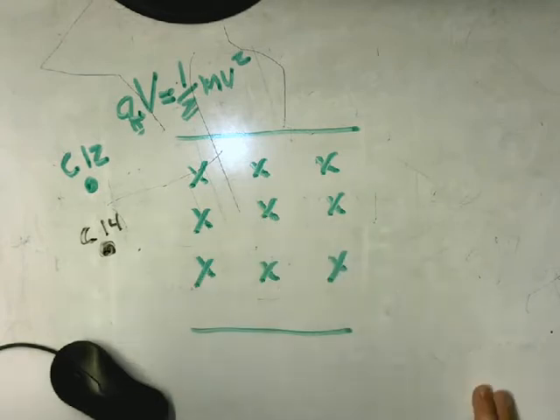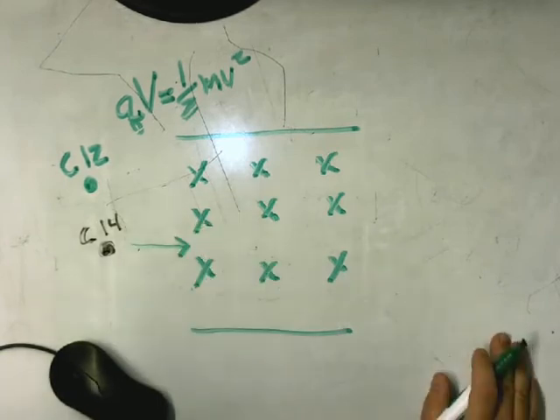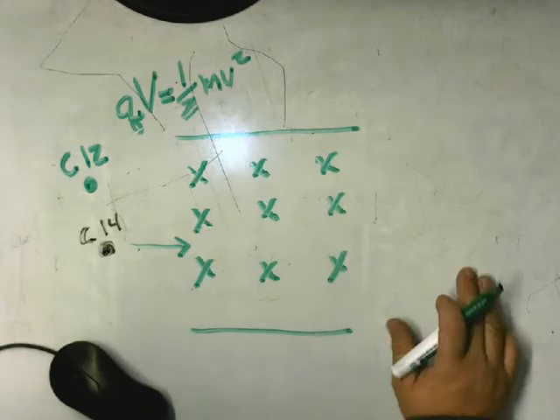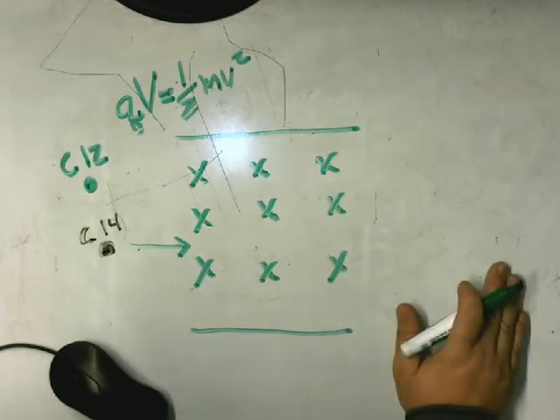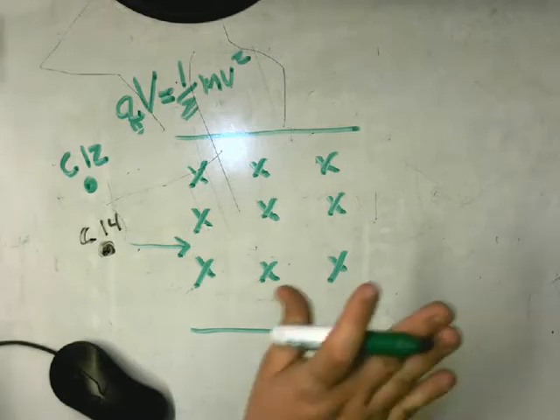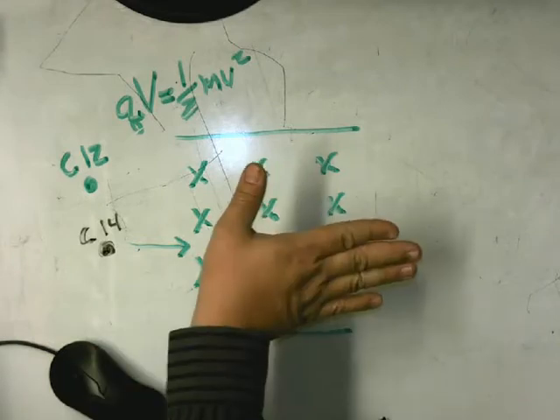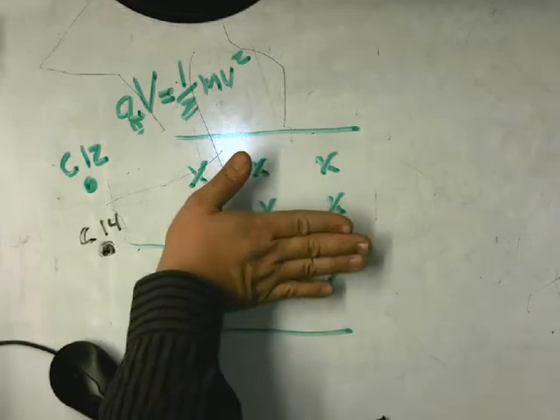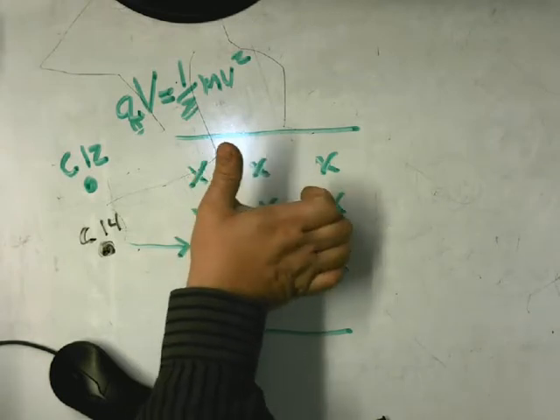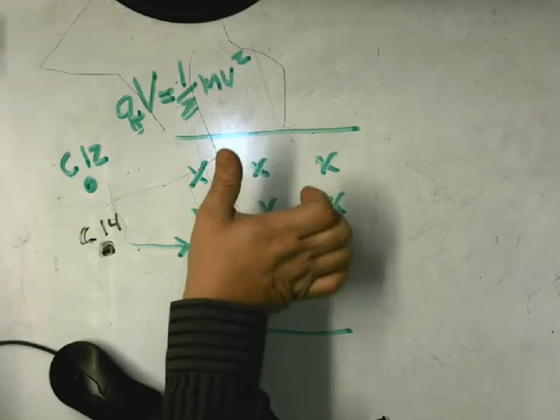in the interaction with a positive charge. So I have this velocity in this direction. Okay? I've got a magnetic field that's heading into the board. That's what the X's are referring to. So what direction is the force that they experience? Well, using my right hand rule, and when I do this, I always make sure I have a pin in my right hand. QV, I'm pointing in the direction of the charge. I'm going to curl my fingers into the direction of the magnetic field, and my thumb is the resulting direction of the force on that charge.